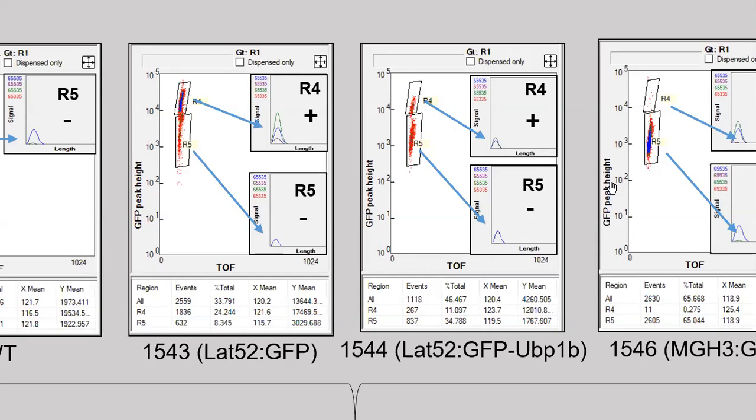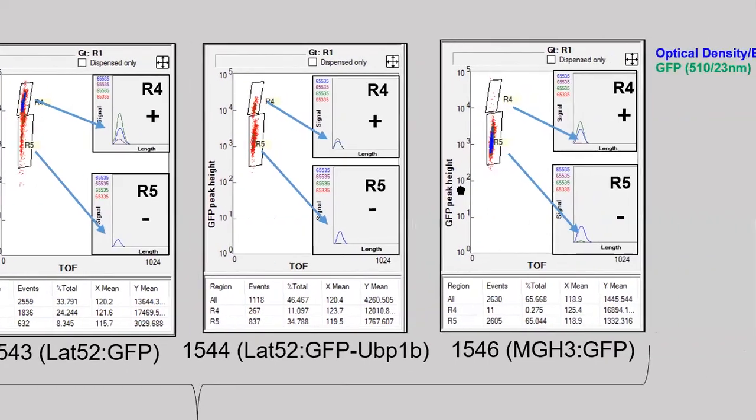And then the third example, the third line here, we see almost everything drop back down to the wild type levels of green expression, almost as if there was no GFP present. Some of the pollen do have GFP expression, and that's because there's going to be some leakiness, and maybe those are going to be interesting for some reason.